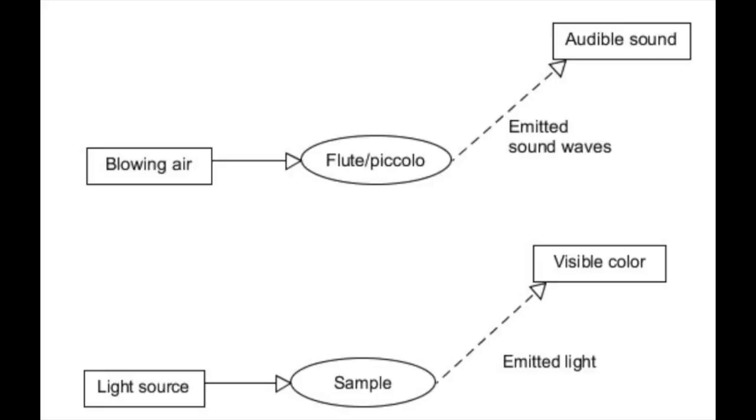Every photon emitted plays a role in the emission intensity at that photon's wavelength, regardless of whether the emission of the photon brings the electron to the ground state. The energy levels available are dependent on the particular atom or molecule's composition.